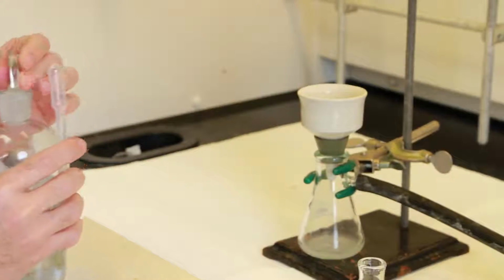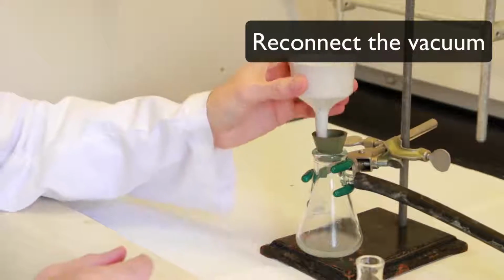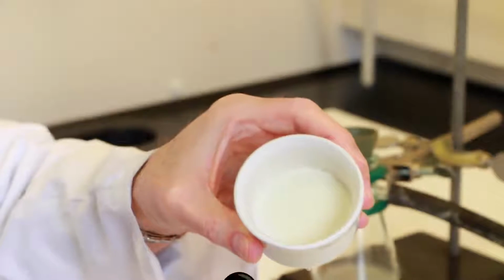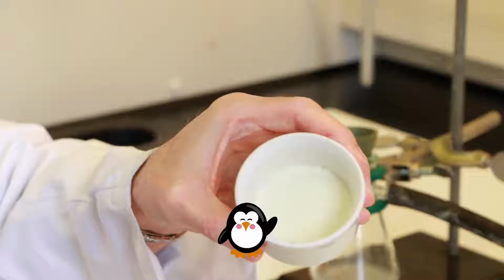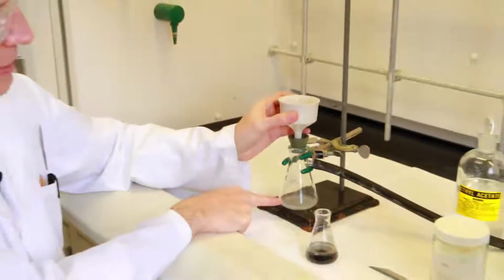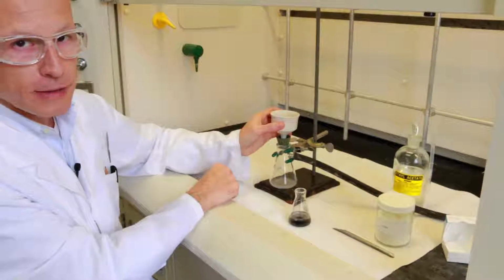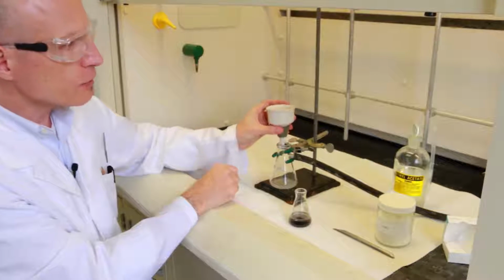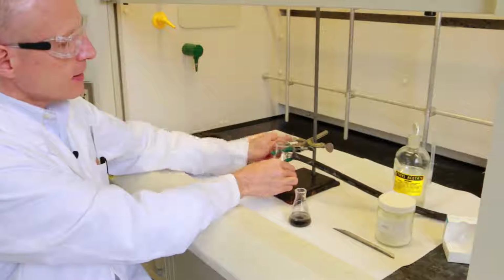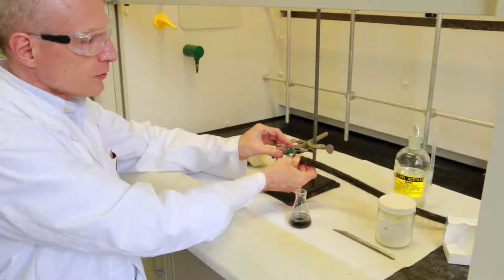Then you apply the vacuum, and you end up with a very uniform layer of Celite at the bottom of your funnel. It might happen that some of the powder goes through and it ends up in your filtering flask. This is normal. So the only thing you have to do is remove the filter, wash the filtering flask, and come back with a clean flask. Now you are ready to filter.